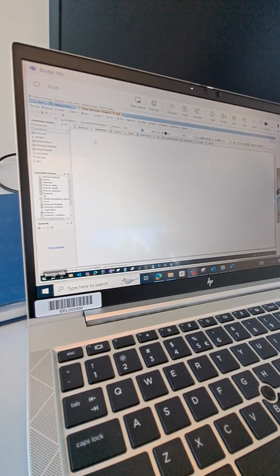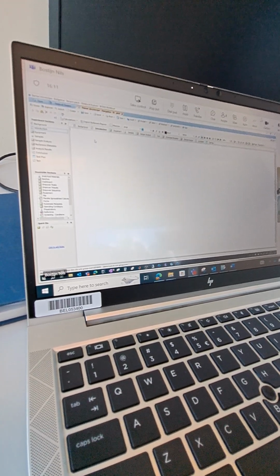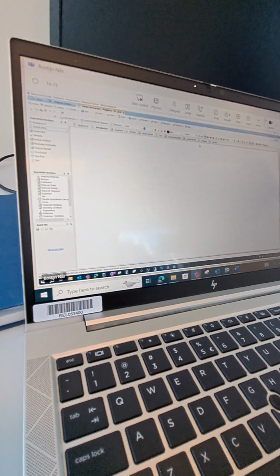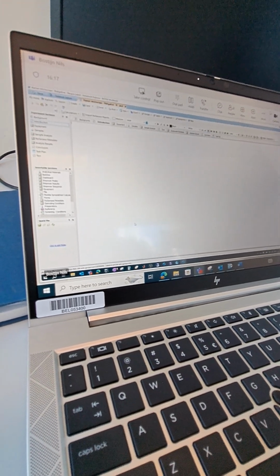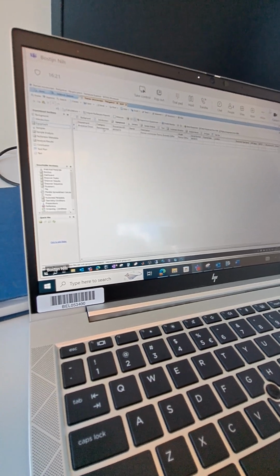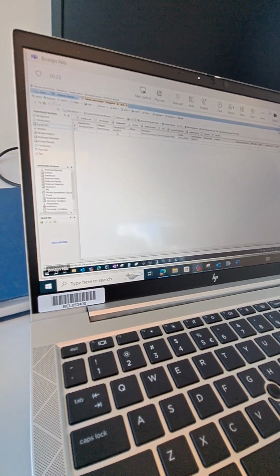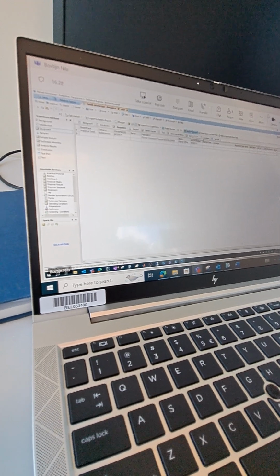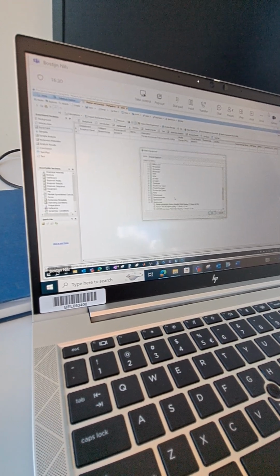Fine. There's no restriction here in terms of information you can put here. Sometimes we just say one sentence. If you want to give more information, that's fine. Okay. Then equipment. Here you can give which equipment you are using. And you can select it from a kind of database.